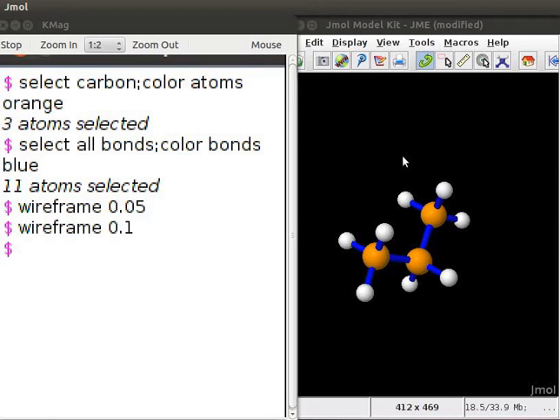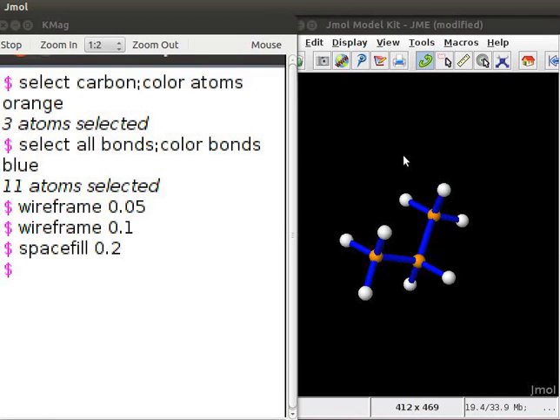To change the size of the atoms, we will use the command spacefill followed by a decimal number. At the dollar prompt, type spacefill 0.2. The decimal number represents the radius of the atom in angstroms. Press Enter. Observe the size of the atoms in the propane molecule decrease in size.